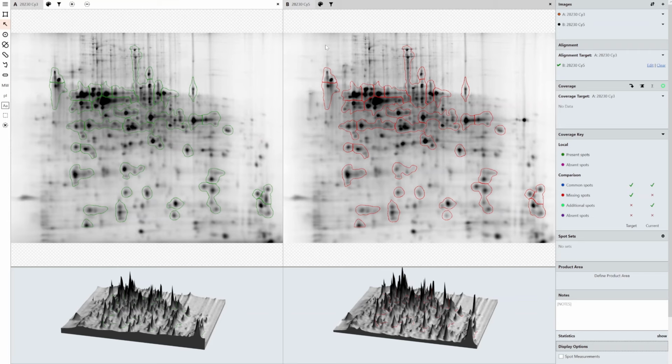And this is especially prevalent in kind of long-term data storage required within QA labs, things like that. So within the software, we've actually built in the ability to change that from the original file name. You might want to keep the file name as it was. You might have on-site protocols that dictate how your file name should be saved. Something like date, operator, cell line, antibody batch number, something like that might need to be kept within the file name. But what we can do is add a nickname to the image to allow you to work on them much easier.